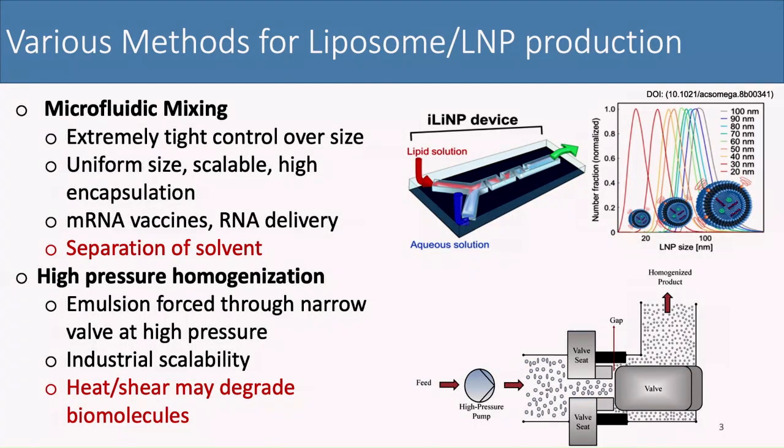And in manufacturing of liposome, they have very different technologies. There are two which are really commercial, which I have put in here. First is microfluidic mixing, where you have two ends in a wide channel, one which brings in a lipid solution, the other brings in an aqueous solution. And there is a very rapid mixing that takes place. In this particular image, there are also baffles.